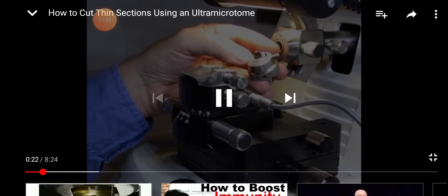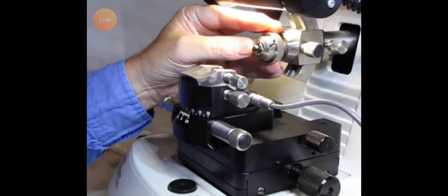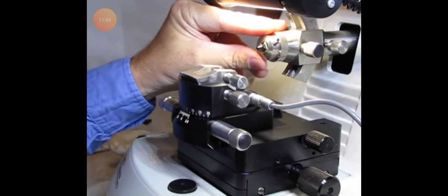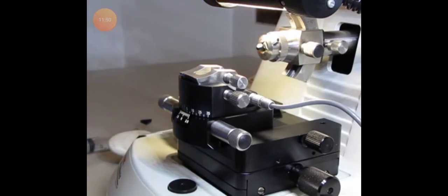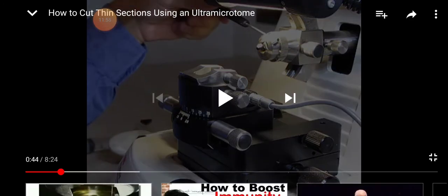If we take a quick look at the tip of the sample, you can see it's already been trimmed into a nice pyramid. It's already been thick sectioned, so that's why it's so smooth on the face of the block. It goes into the sample arm like that. That's the part that moves it up and down over the knife. So in this ultramicrotome, the object holder will be moving up and down, and here the knife is kept stationary. Tighten it using the set screw that's on the side.